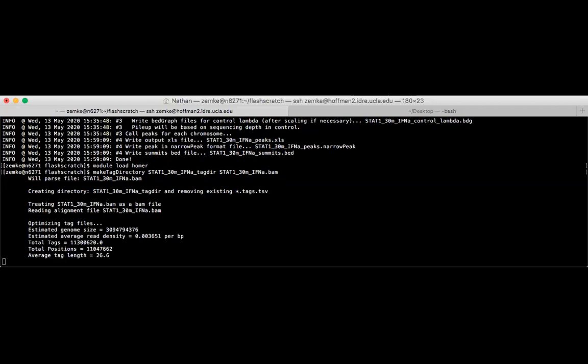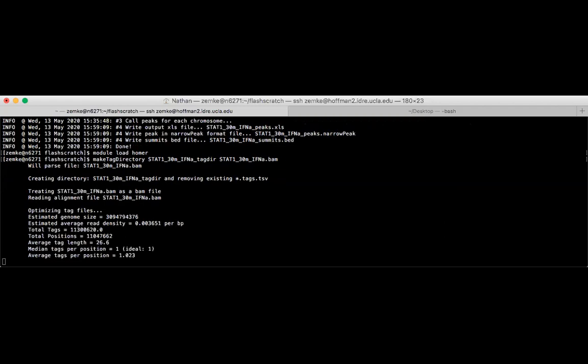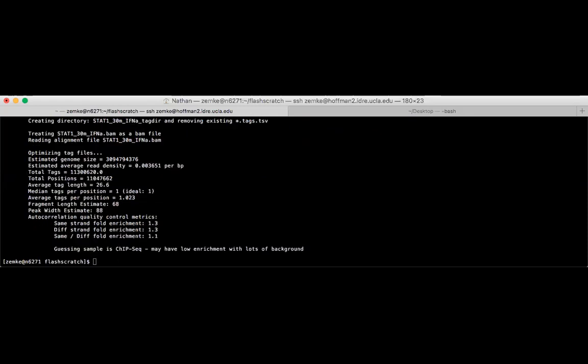While we aren't going to be doing that for this workshop, because we really don't have time for that, plus all the other visualization programs that we're using, a recommended program would be DESeq2 or edgeR, which are both used with the DiffBind program.